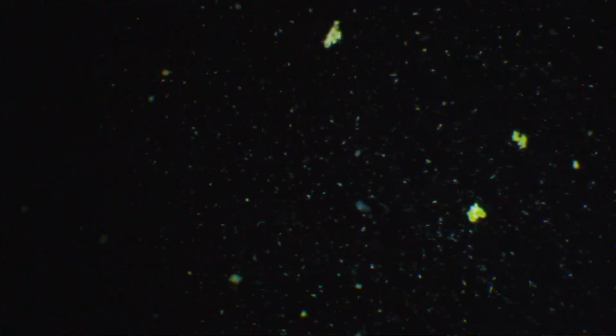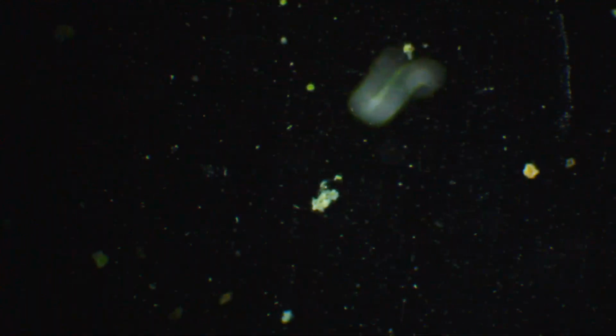Not a whole lot. It's tricky because, like I said, we're only using one drop for this, so the chances of getting something in some of these are going to be slimmer. Might have to make a couple of tries to get something, but that's okay.